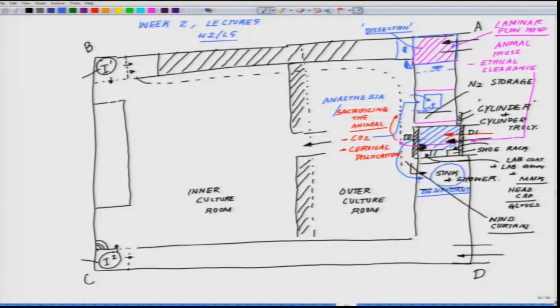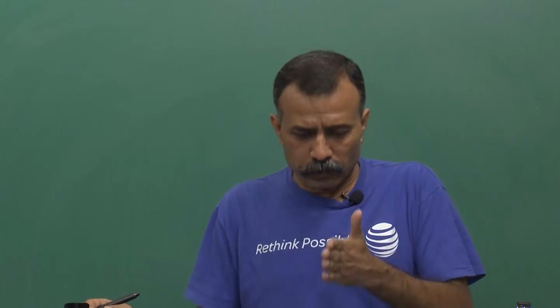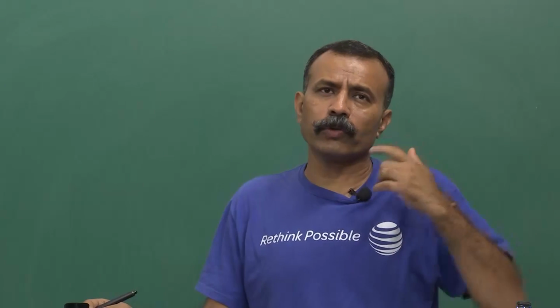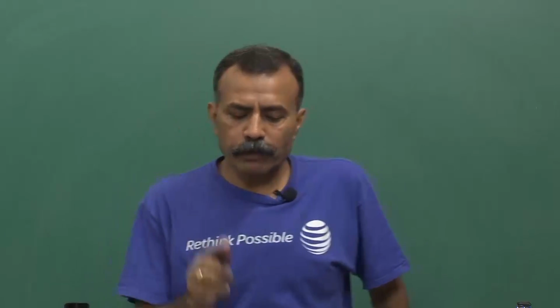Then whatever way you want to dissect it out, whether you are decapitating the head, or you want to remove some kind of gut tissue or muscle, or isolate the cardiac tissue, or the brain, the rest will follow, but this part is very important.